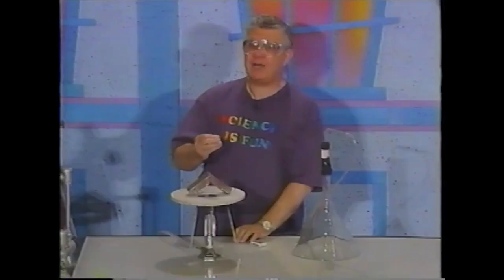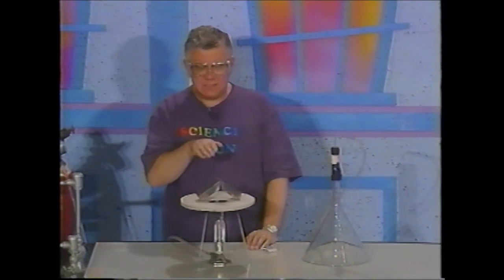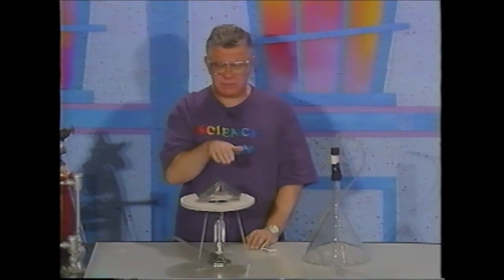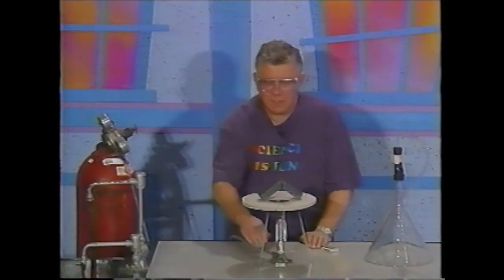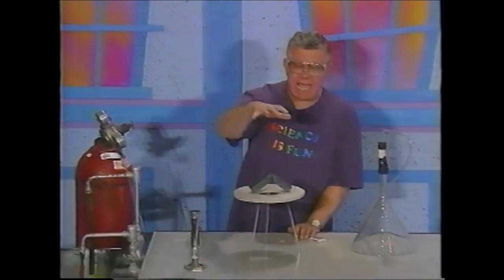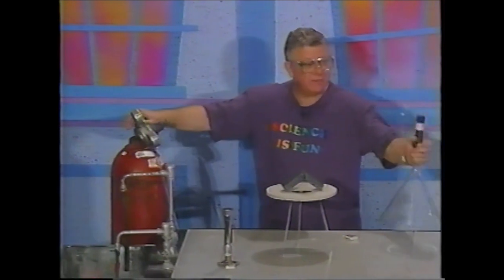What is happening is the hot copper surface is combining with oxygen from the air and forming a deposit of copper oxide. So copper oxide is a lot duller in appearance than the shiny copper surface. You can see that now. What I'm going to do next is turn off the flame completely, and I'm going to add some hydrogen gas to this copper from this cylinder that's hooked up to this funnel.